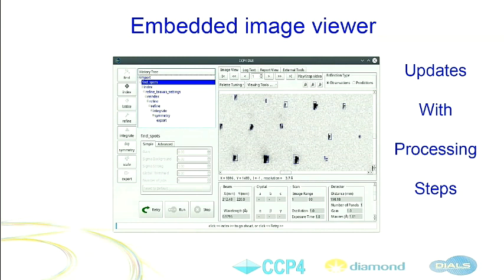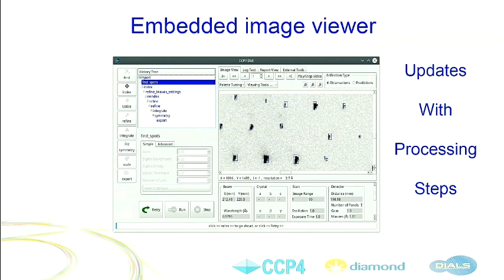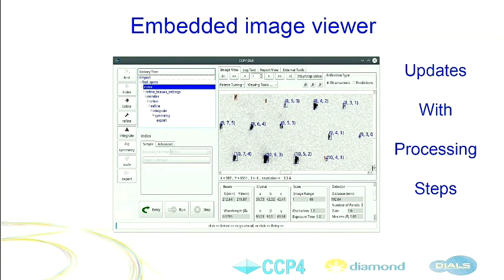If you see these rectangles here, they are the output of Find Spots. In the previous step there are no rectangles, and after spot finding it puts the rectangles — the result of spot finding. If you continue processing you will continue seeing results here. After indexing, the first indexing it does is in P1 — it puts Miller indices on all the results. The spots that were found in the first step: if it was capable to fit a crystal into your experiment, it puts Miller indices on your spots. A couple of spots that don't fit the model are shown in red — they don't have Miller indices. The Image Viewer tells you that.